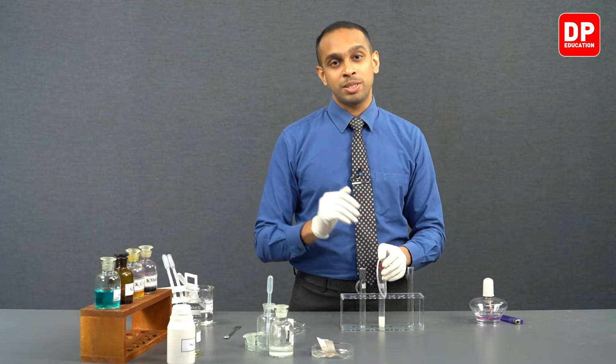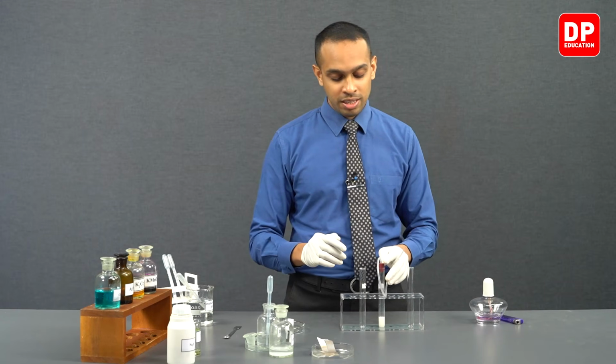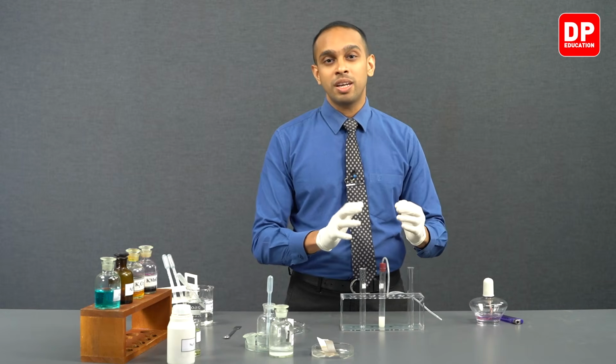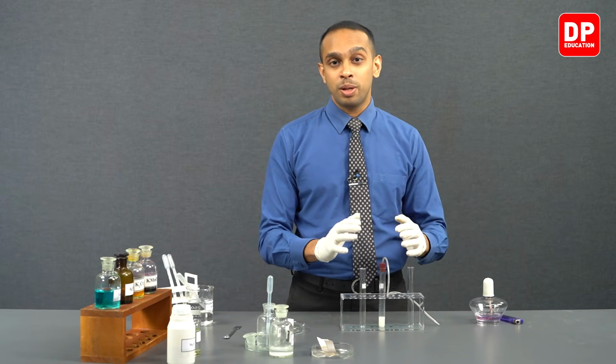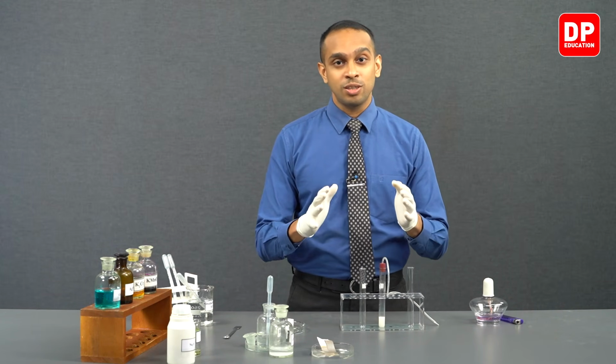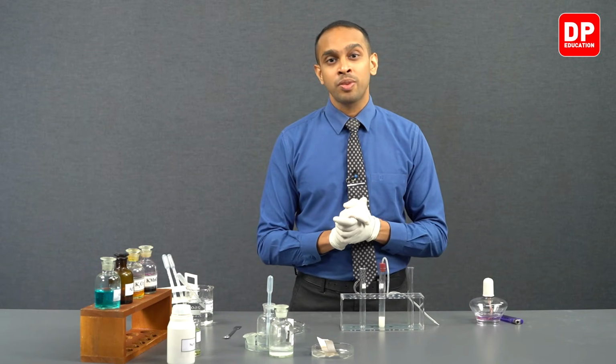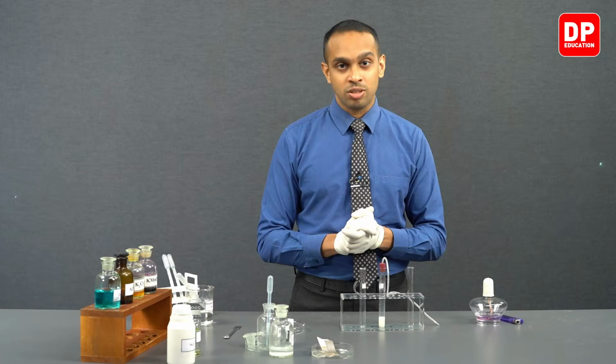Now students, let's remove this setup from over here, because we have now produced hydrogen sulfide gas, it is not a gas that you should be inhaling. So therefore, let's remove this setup and move on to our next step.